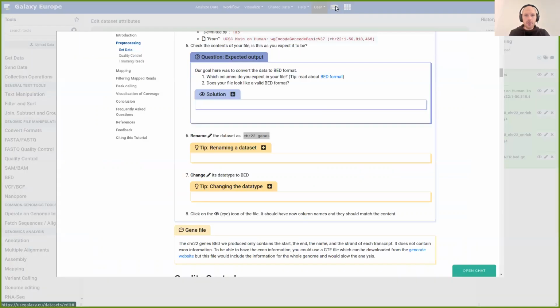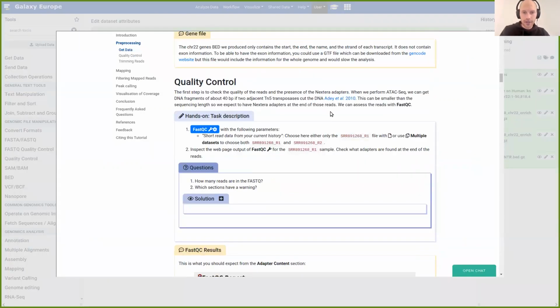And now let's begin the actual training, so to say. You know from the Galaxy introduction and also from the Galaxy quality control training that in any next generation sequencing experiment and data analysis, you have to do a quality control to see if your experiments worked, if there was a quality breach with the sequencing, or with your experiment. And also to see if you have technical biases in there, which you assume and anticipate from your protocol.